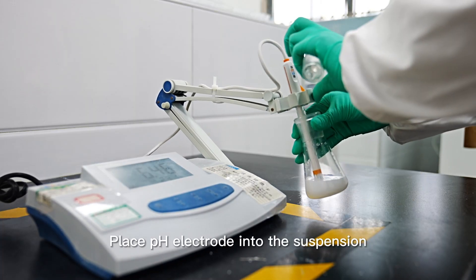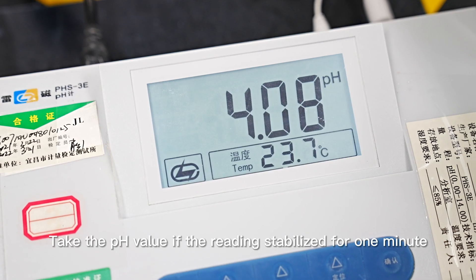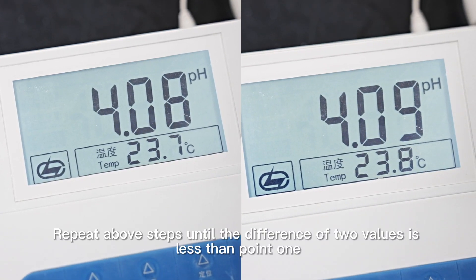Place the pH electrode into the suspension. Take the pH value once the reading has stabilized for 1 minute. Repeat the above steps until the difference between two values is less than 0.1.